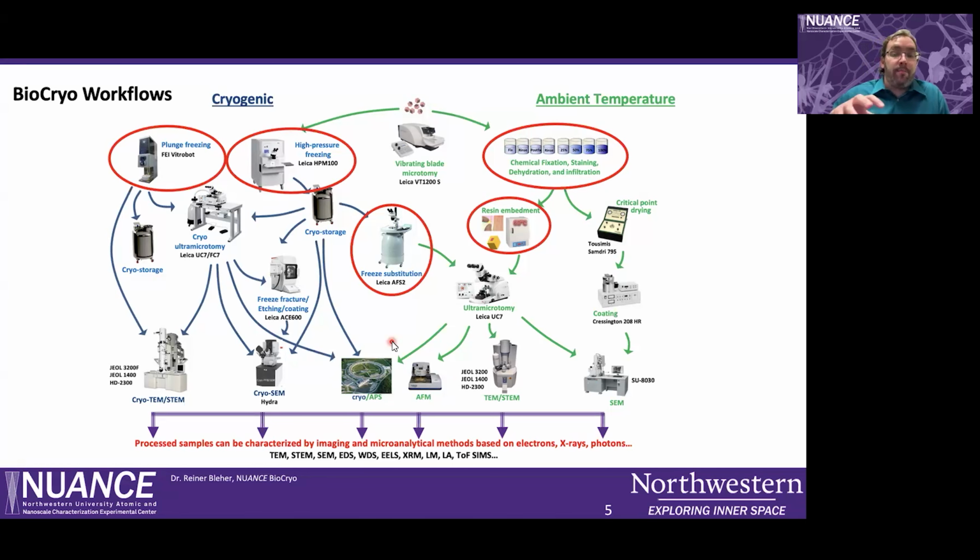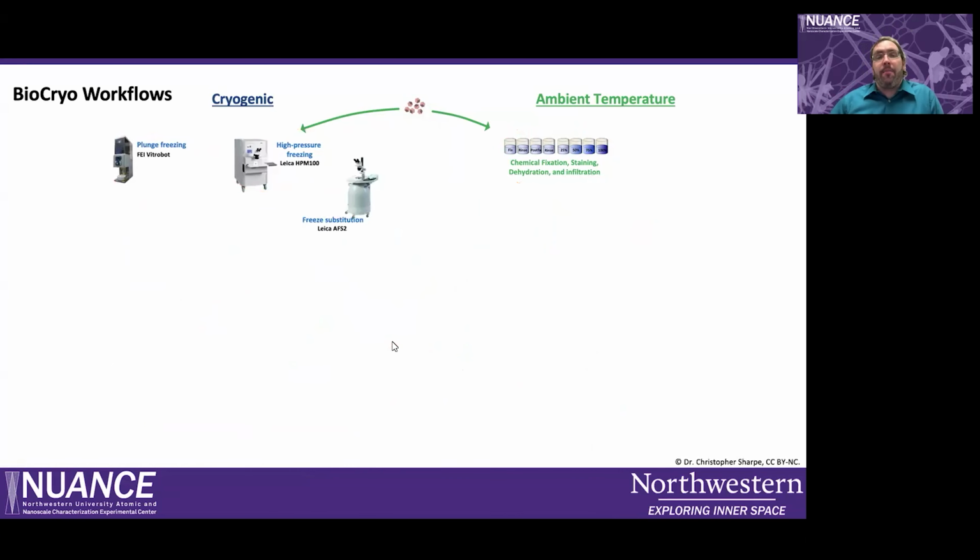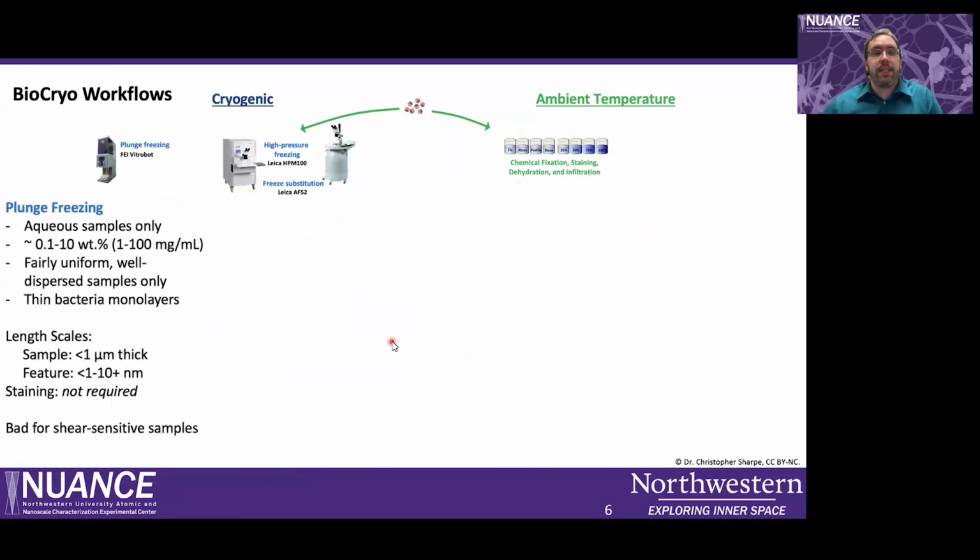So you really can take your sample anywhere else and work with them once you've gotten your sample embedded or prepared. So to really go into the details of each of these techniques, let's start with plunge freezing.